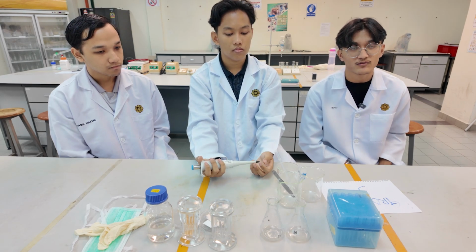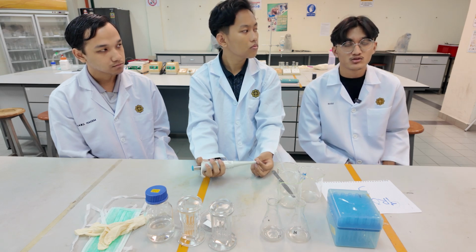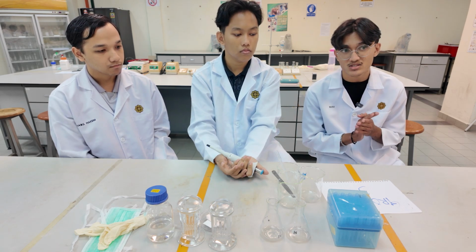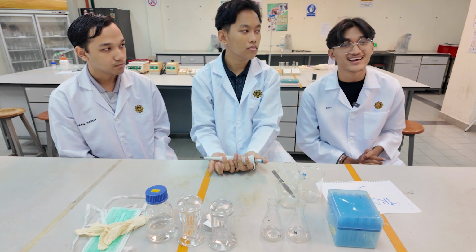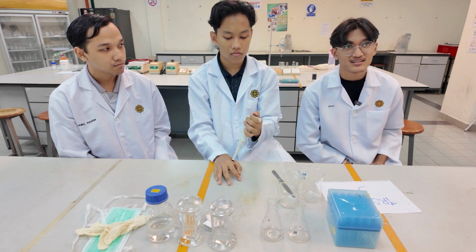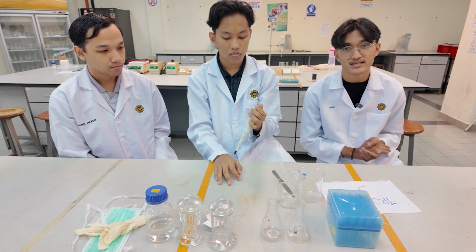For this industry, the cosmetic industry, we use TLC to check whether they use active ingredients such as salicylic acid, which is, who can guess, in what? Corrosion. No, in acne cream or UV light. UV light in sunscreen, correct. And they use this with the right amount of concentration. If they use the concentration higher, it can cause harm to the skin.